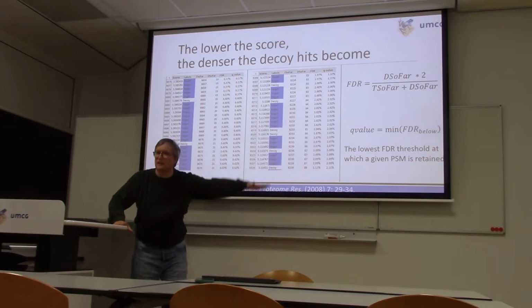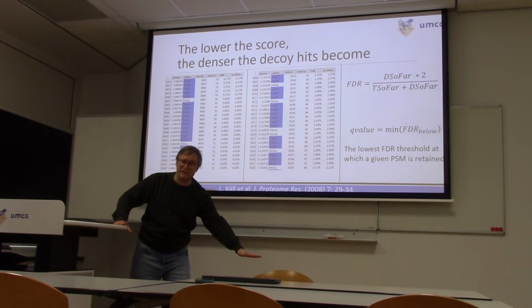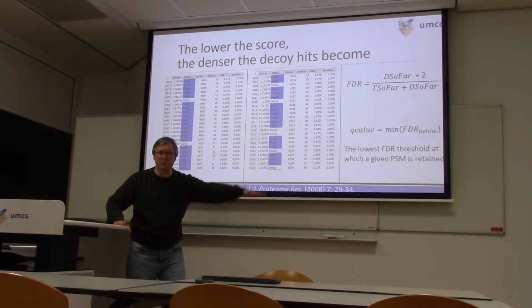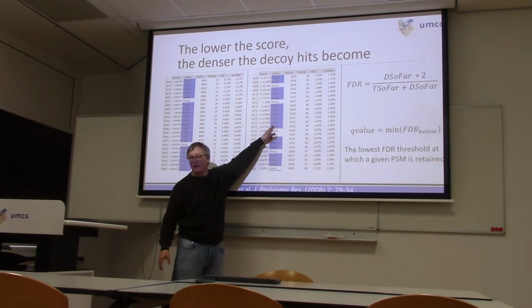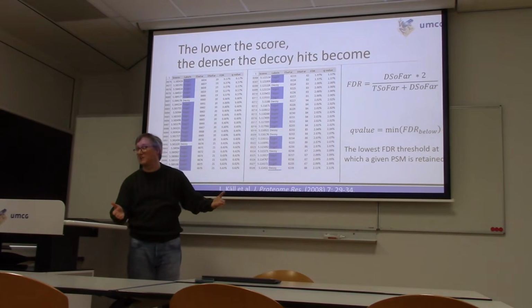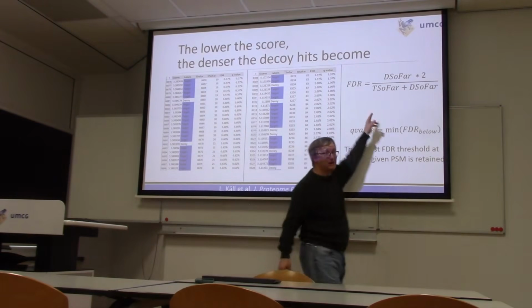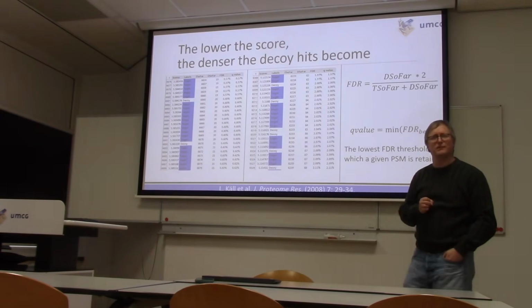So when I make my estimate of my false discovery rate, I'm going to be dropping kind of a bar down this list, and I'm trying to find where is low enough for good sensitivity, but high enough for good specificity. Basically, I'm trying to find how to counterbalance good possibly real hits without dropping too many false decoys in the mix too. Okay? The way that we do that typically is simply to double the number of decoys.